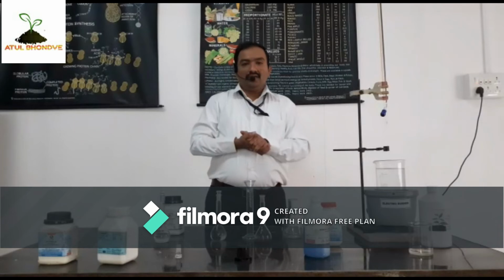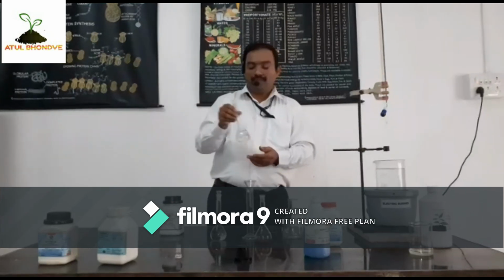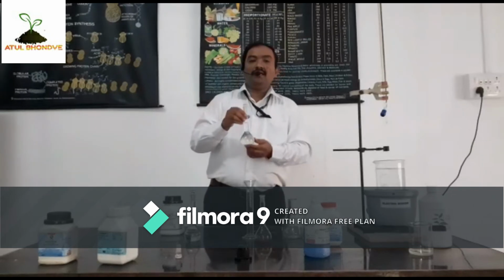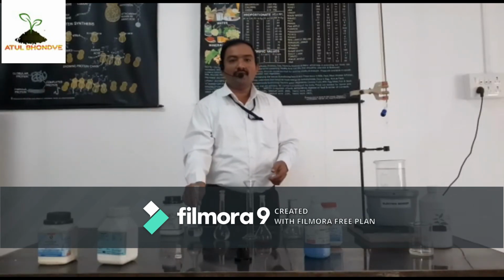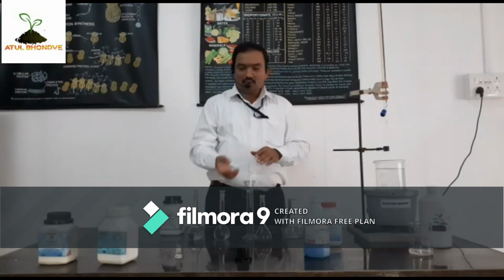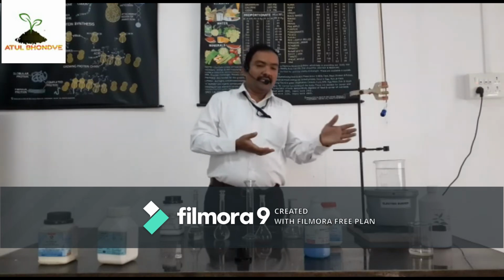Second, again we will use another solution called the test solutions. We prepared the lactose solution and the fructose solution, so fructose and lactose solutions are available with us. Fill the burette with these solutions and perform the practical like the first part, that is, using Benedict's reagent.